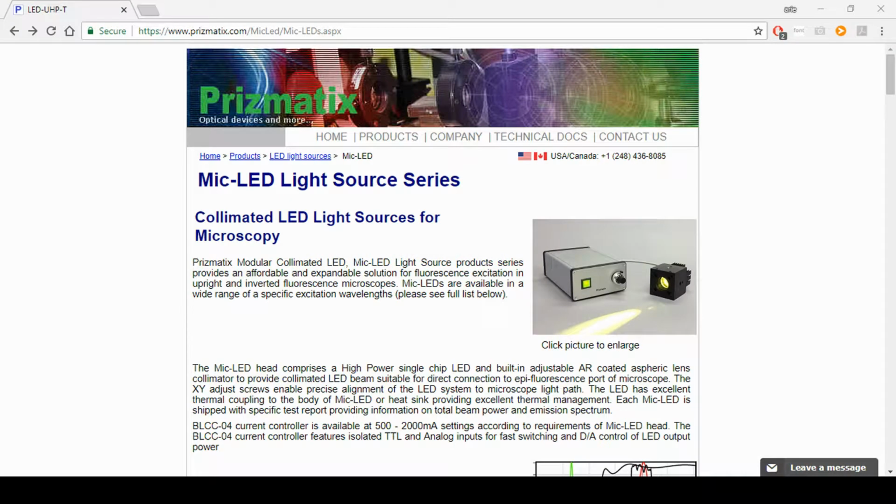Hi, this is an instructional video on how to use the Prizmatix LED Spectrum Viewer.